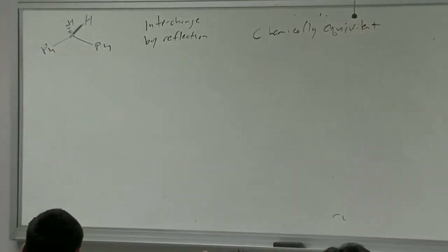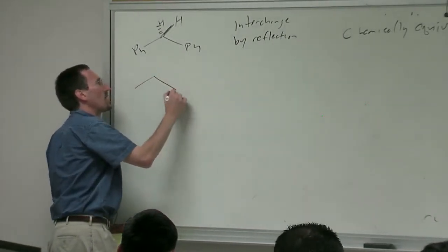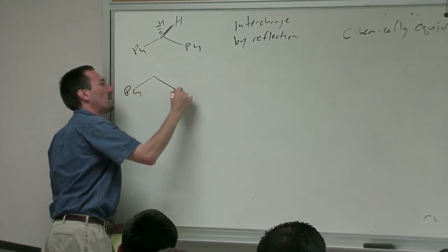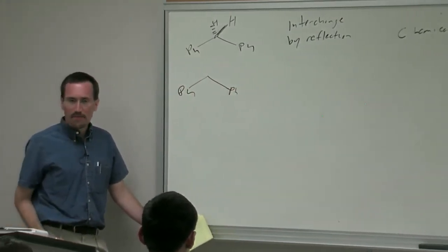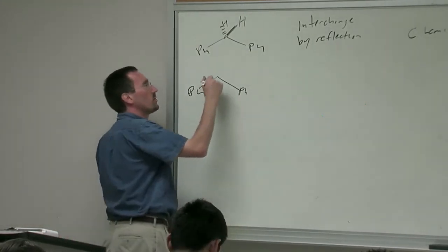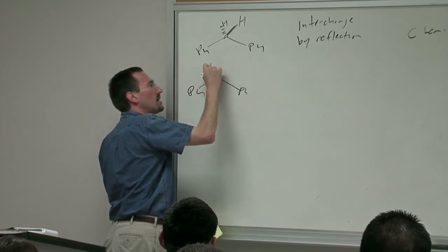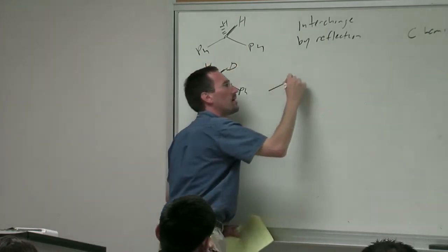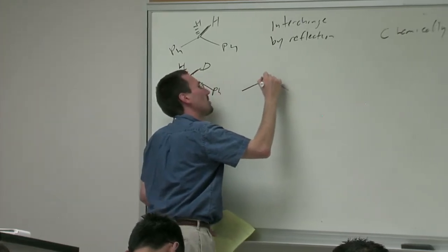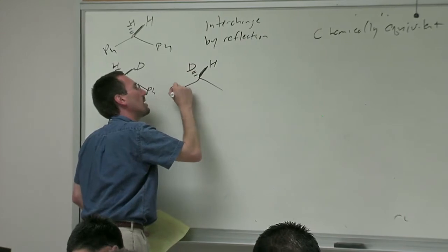But we're going to get into some cases that at least the first time you see them are tricky. And another way to do it is just to perform a little thought experiment and say, all right, what is their topological relationship to each other? And the way you do this thought experiment is you replace one proton by a deuterium and the other proton by a deuterium.